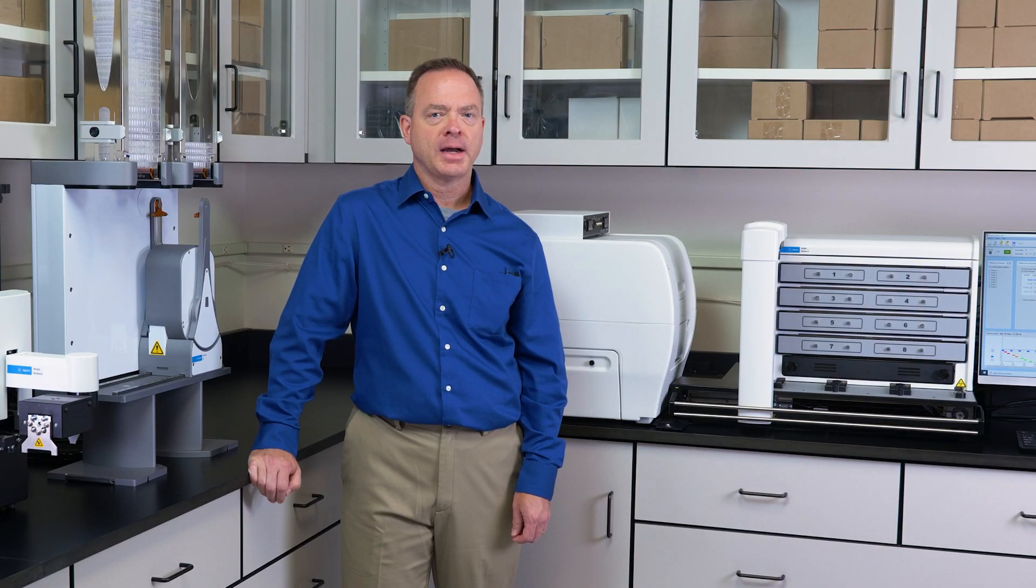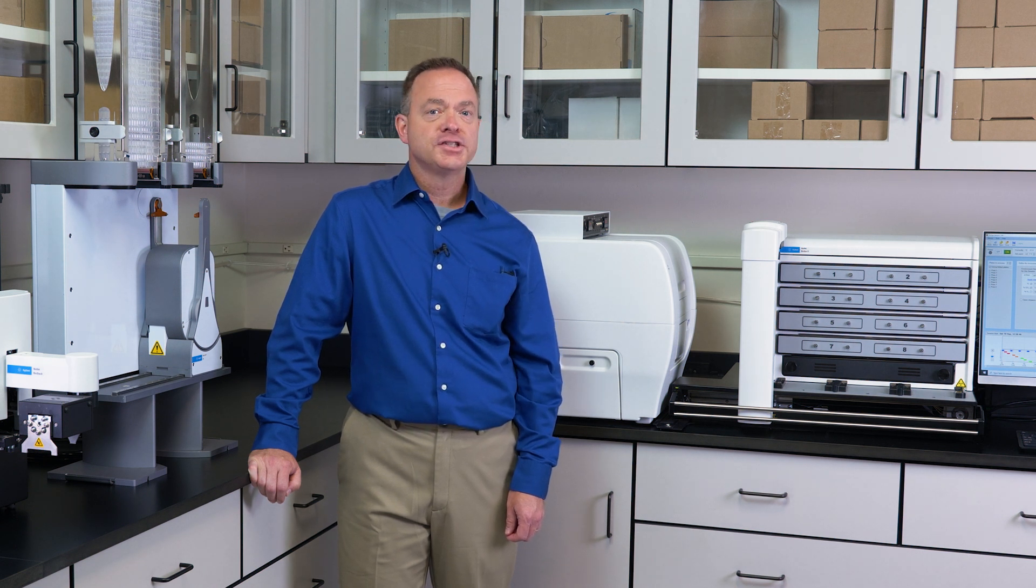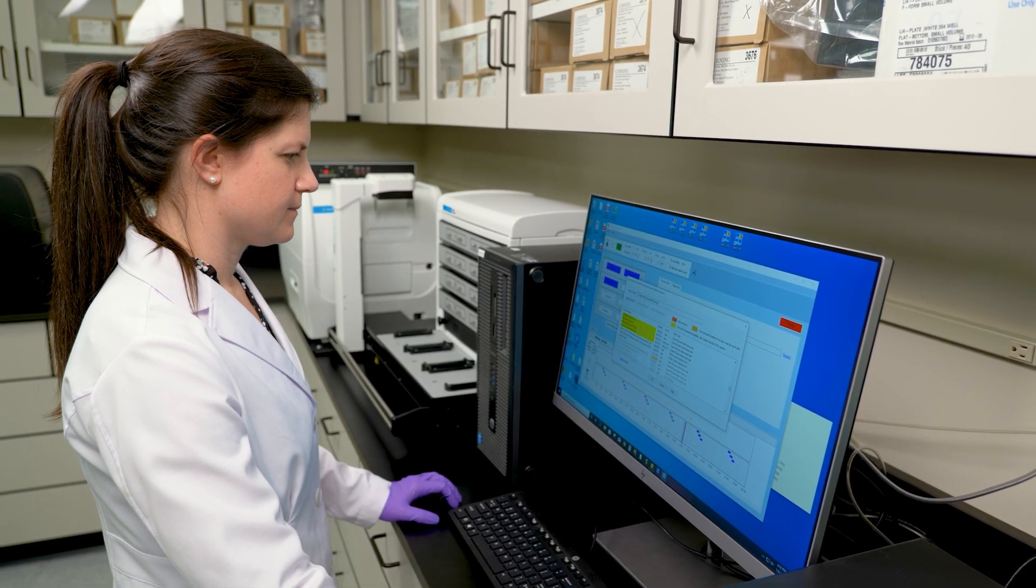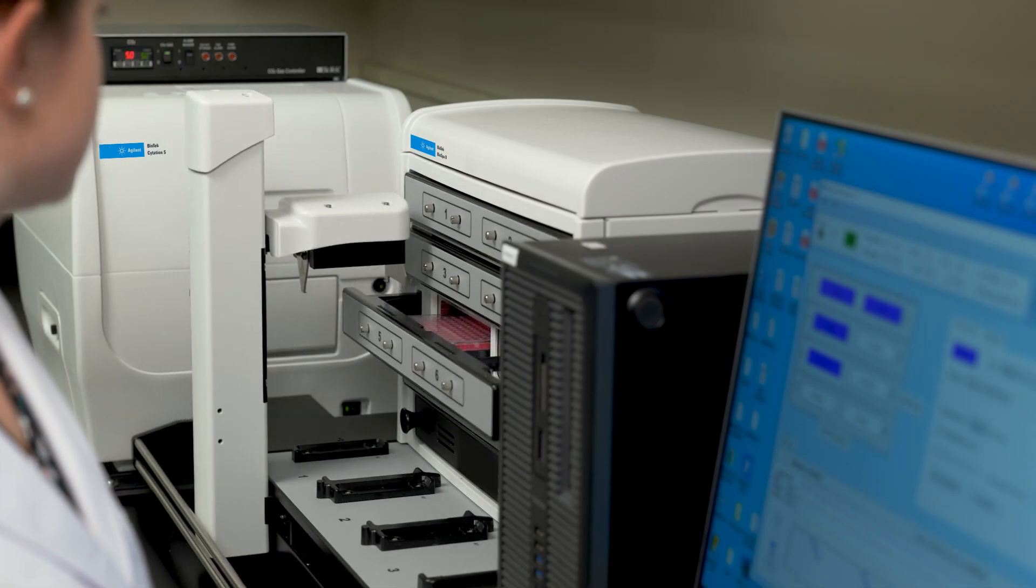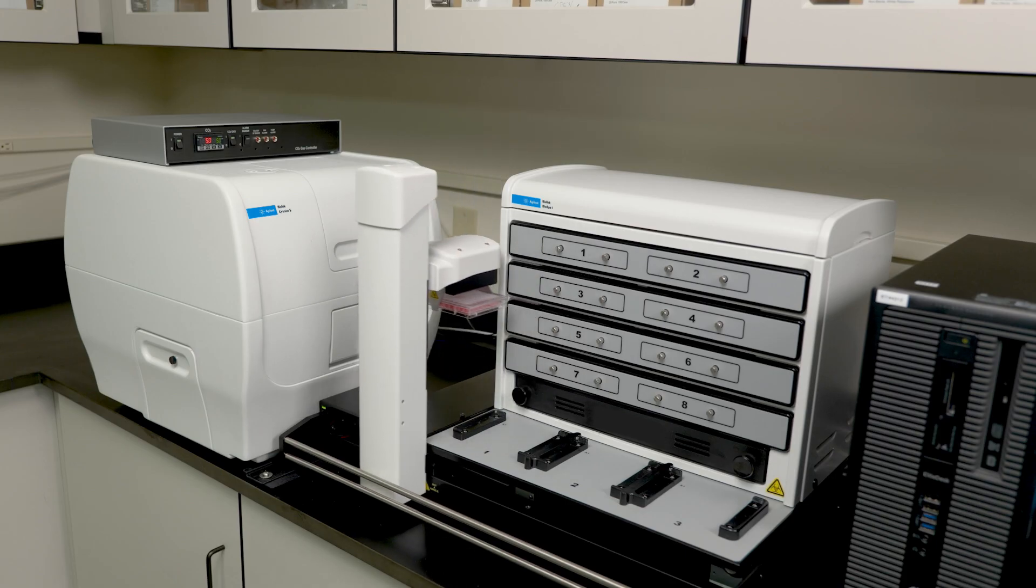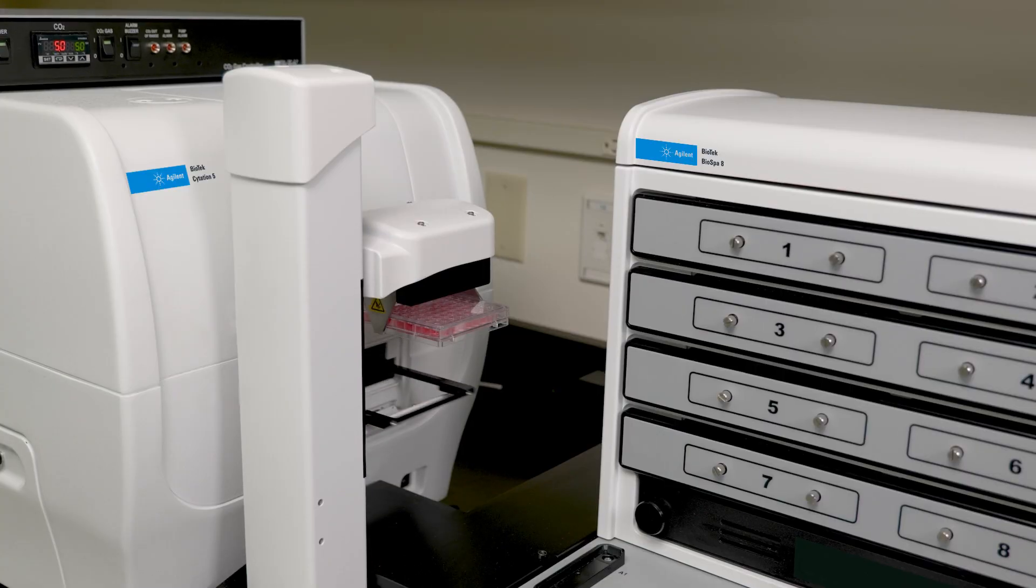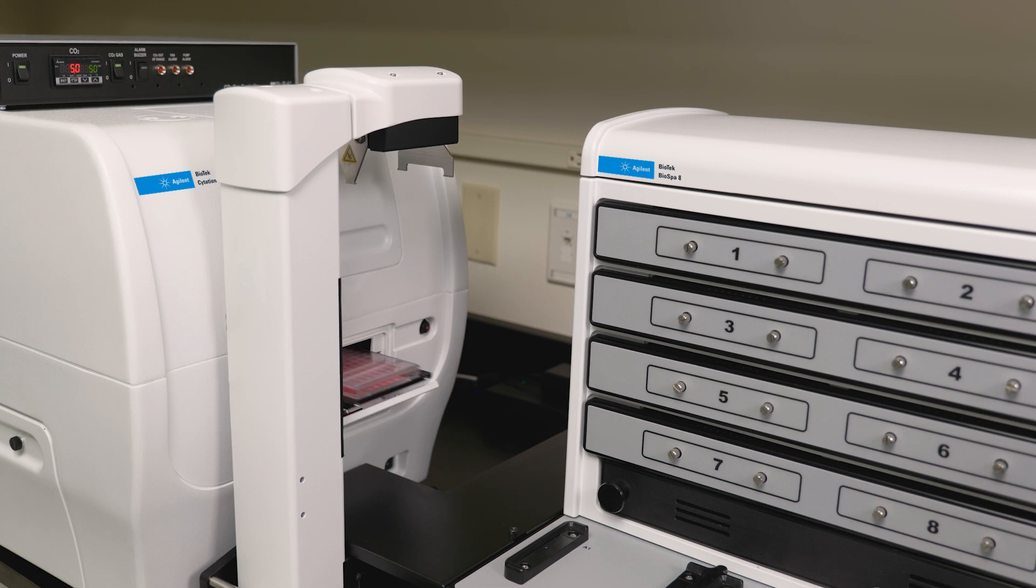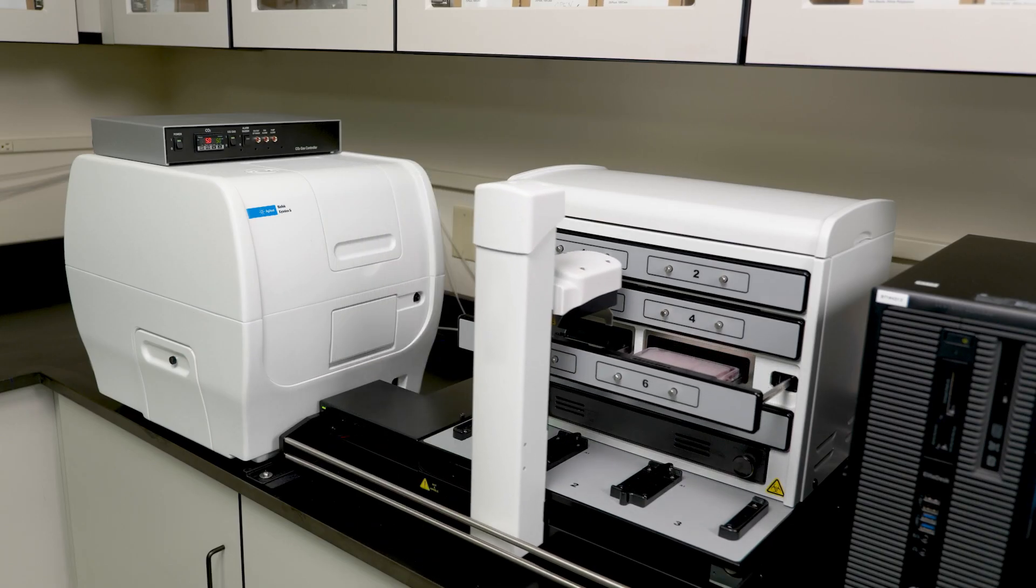A particular advantage of the BioSpa is that when a microplate reader or cell imager are attached, the combined system can be maintained on a laboratory benchtop. This means that an additional incubator does not have to be purchased to run the system, makes loading and unloading the BioSpa quick and easy and also keeps the electronics and optical system of the reader or imager from being exposed to high temperature and high humidity conditions as required by other systems.